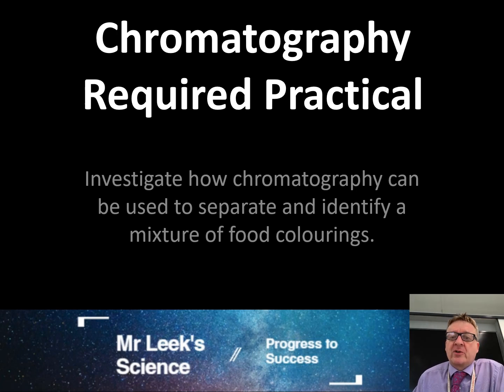This is the chromatography required practical. What we're going to be doing is investigating how chromatography can be used to separate and identify a mixture of food colorings. It could be a mixture of anything.